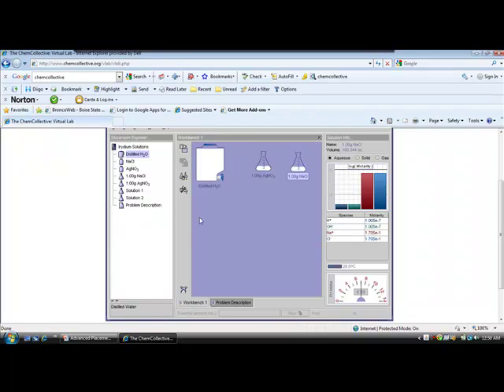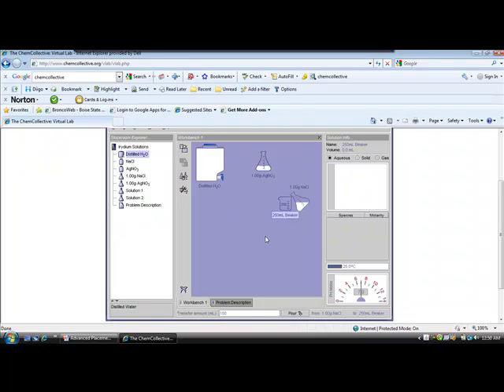I'm going back to the workbench. I want to add the 1 gram of silver nitrate to the 1 gram of sodium chloride. Well, we want to do this just as we would in a lab. We don't want to mix in the containers of my stock solution. So I'm going to add, and I believe if I touch that beaker, I did, I can drag it over as I tried to illustrate earlier, that by dragging the sodium chloride flask over to the beaker I can pour into there. And I know I've got 100 milliliters of that, so let's pour in our 100 milliliters into that beaker.